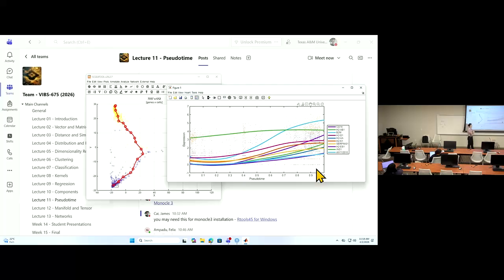My concern is that since the y-axis expression is there, can you attach some significance to how reliable the pseudo time is based on the expression? Like the ones with expression around 3 versus the ones that are low. This is a really high expression.